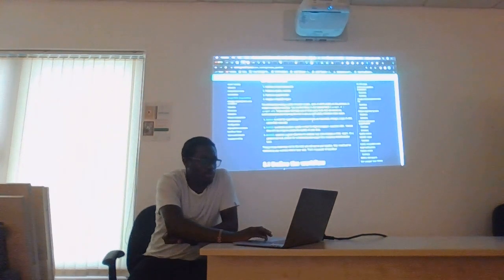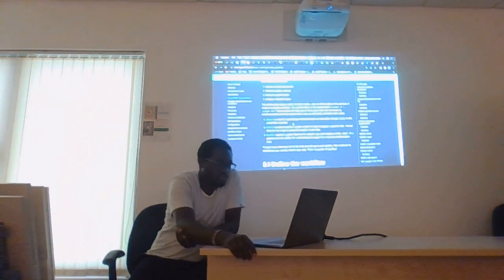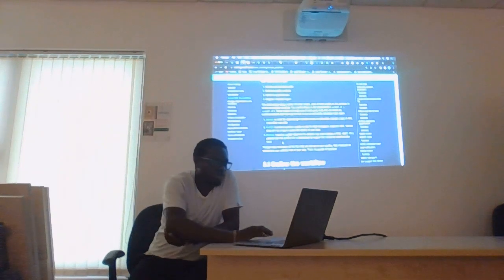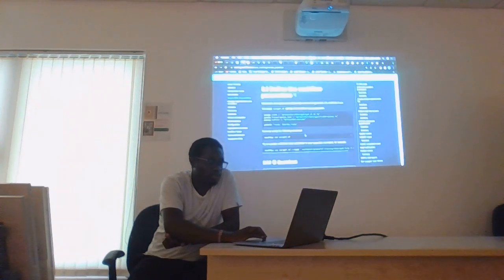And the workflow depends on a couple of tools or software which are needed for it to run successfully. So one of them is Salmon, which is a tool for quantifying molecules known as transcripts through a type of data called RNA-seq data. FastQC performs quality control and MultiQC gives a summary report on the outputs from the different tools that we often use. Okay.